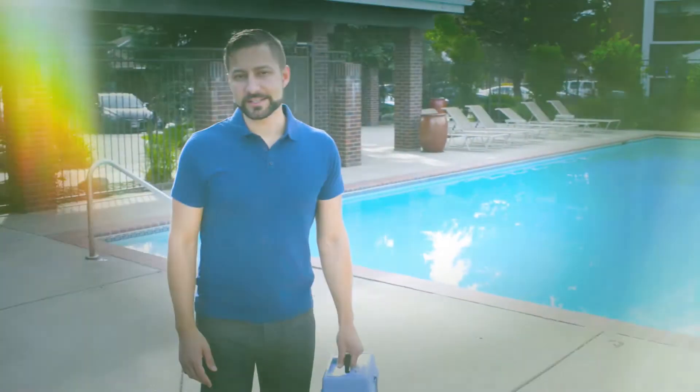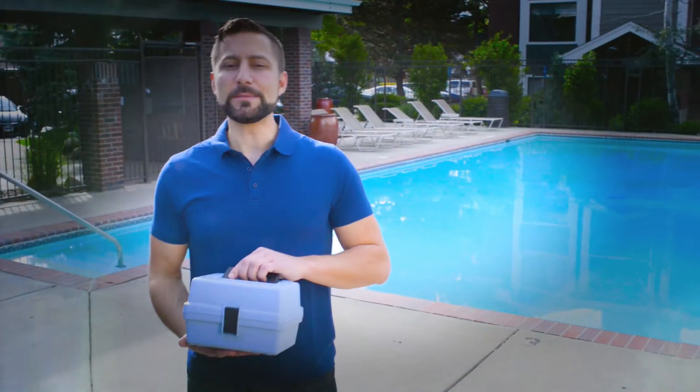Today we're going to show how quick and easy it is to get reliable test results with the DPD Pro test strip kit. Let's start with the most frequently tested parameters for public pools: free and total chlorine as well as pH.